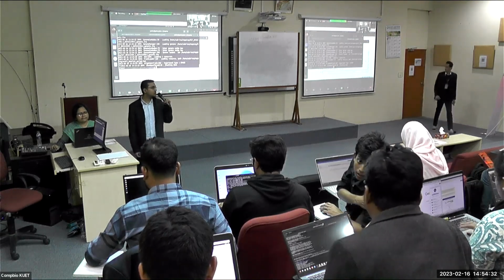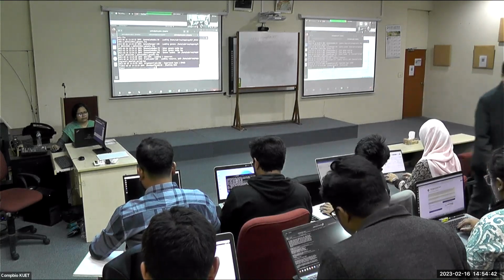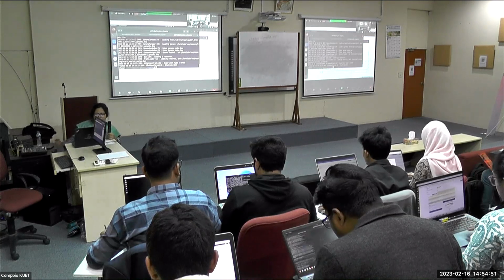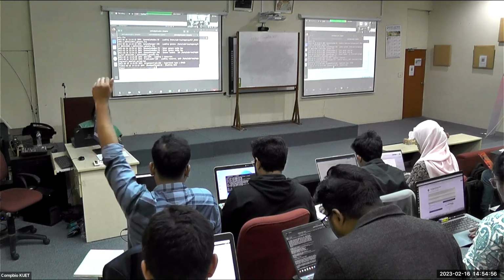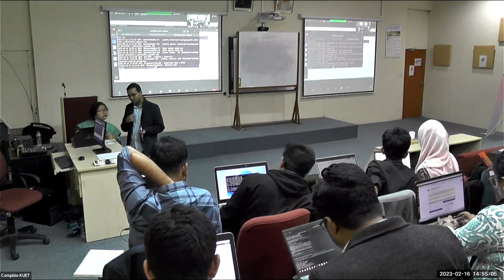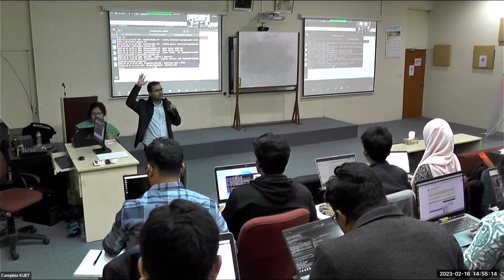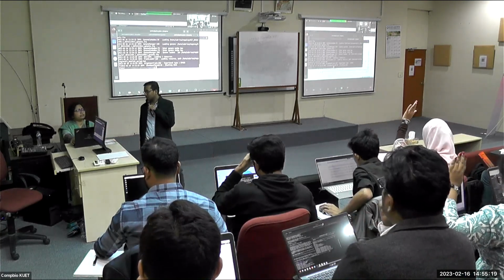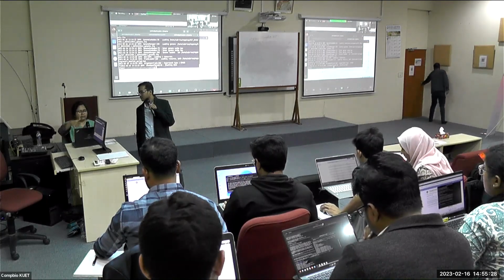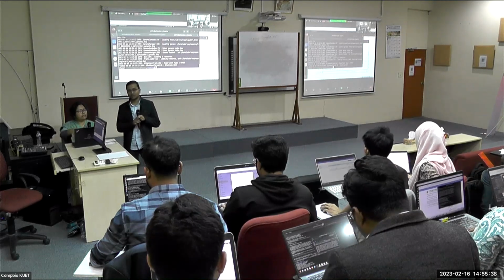Now, how many of you can't access OSC right now? Raise your hand. Client login, then put the username and password there. Okay. How many of you haven't uploaded the mapping file or folder to the OSC? Raise your hand. I asked to upload the FNA file, the reference genome file only, in the mapping directory there. We created a directory in the HPC and then put the command to upload the file there. Only the FNA file, the FASTA file, the reference genome file. We will do the mapping there again.